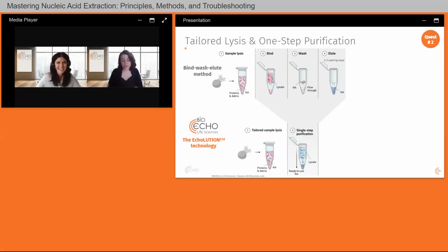Nike, you talk a lot about challenging samples during your presentation. And I have a question about FFPE, which are such valuable samples, but really difficult to isolate. So how can someone prevent extraction failures from FFPE samples? I think, so yeah, FFPE is a very precious sample. The question is, what do you mean by extraction failures?